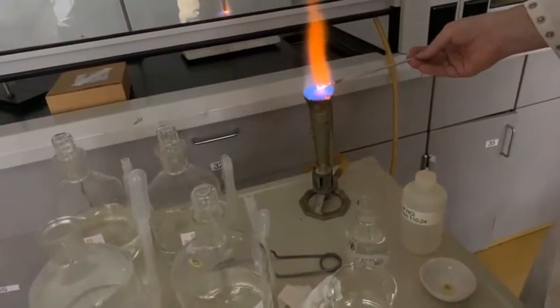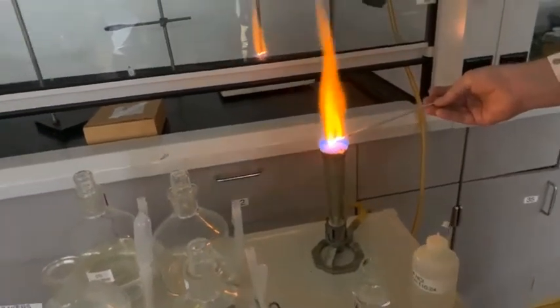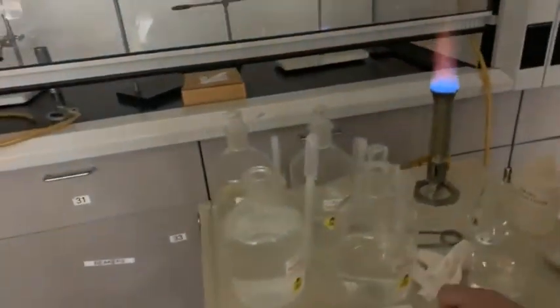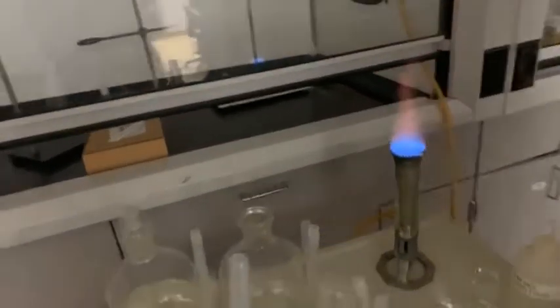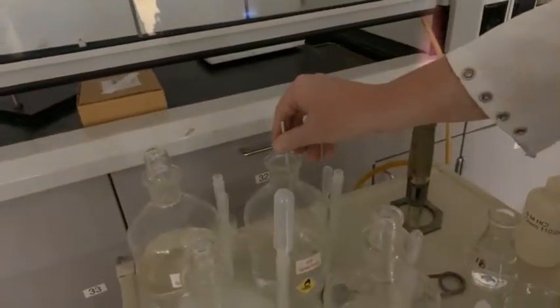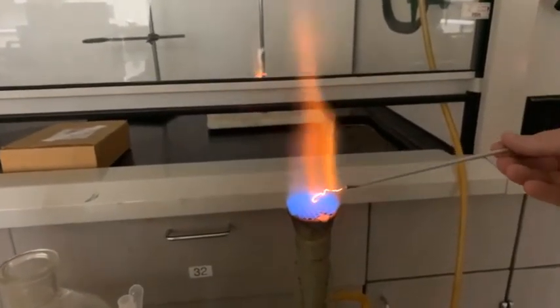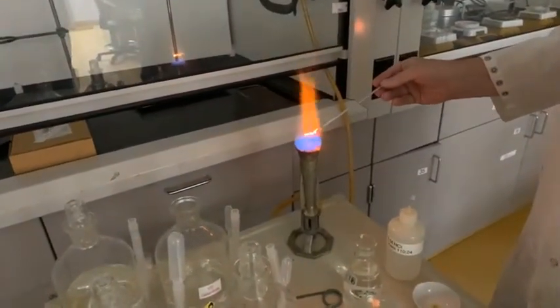All right, we want to be comfortable with what the flame looks like when it's glowing the brightest, and this is a residual sodium flame. Calcium flame is one of the most difficult ones to see compared to sodium because they're both orangish colored. This one is just a red or orange, and it's gone. Let's try it one more time. I'm going to be bluntly honest. There it is, that reddish orange glow that we had for a second. And now we're back to a yellow-orange glow that is not calcium.